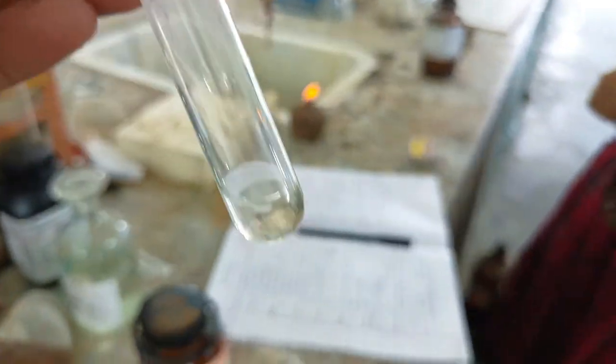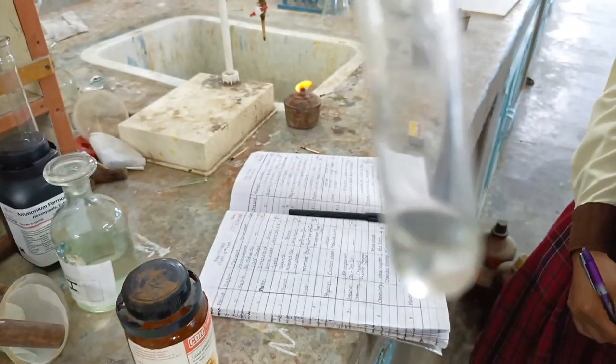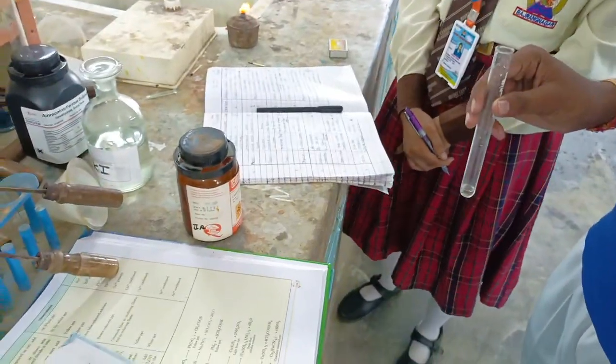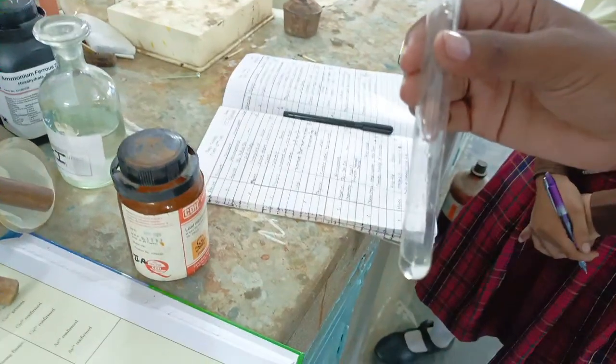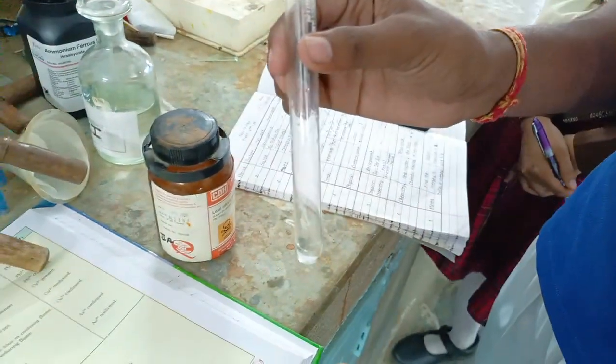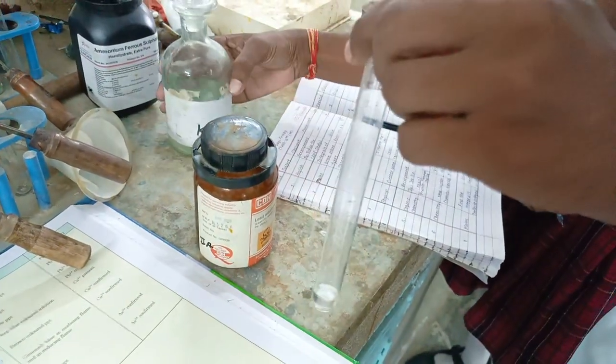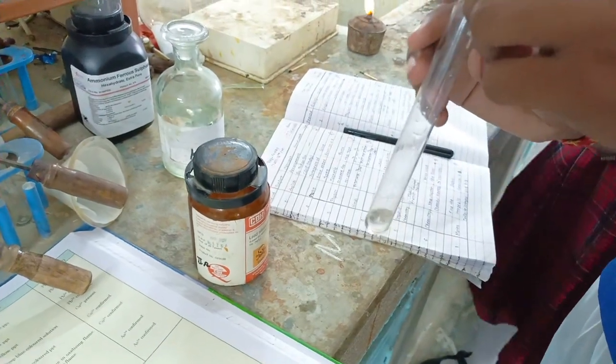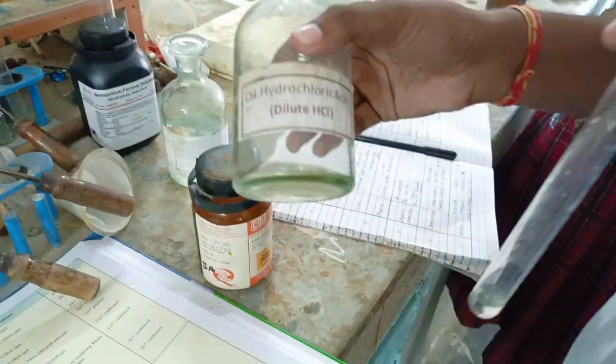That is the original solution. After taking the original solution, we will add dilute HCl to this original solution. After adding the dilute HCl, white precipitate will form.